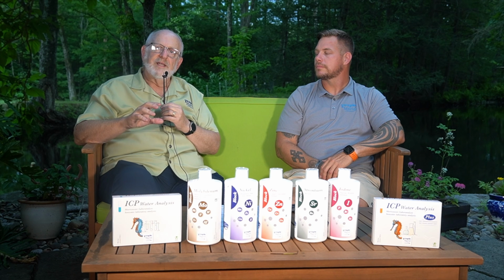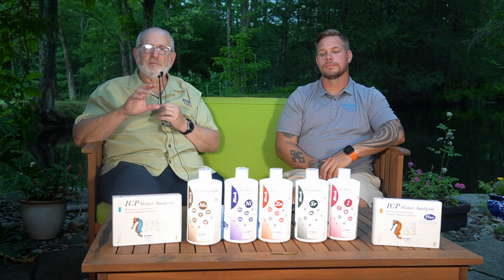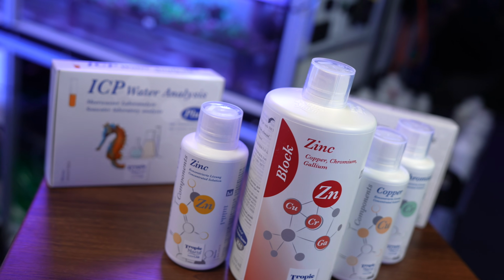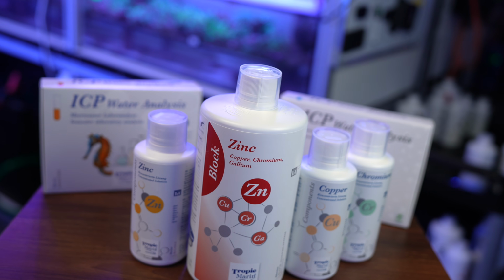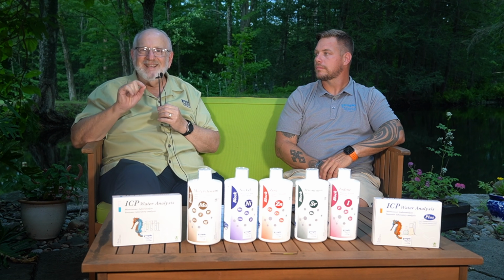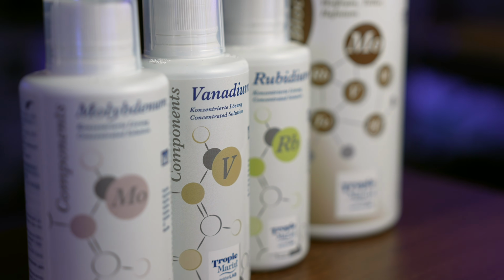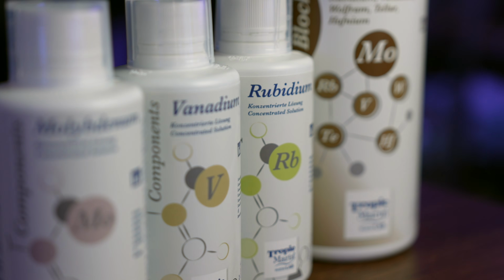And the cool thing is that one of the deficits of ICP testing is that many of the elements that we're trying to test for exist in concentrations that we want to have happen that are actually below the concentration limits of ICP testing. In those families, though, there's always an indicator element that we discovered depletes in a certain ratio that is related to the other elements in that family because they're all doing the same job.